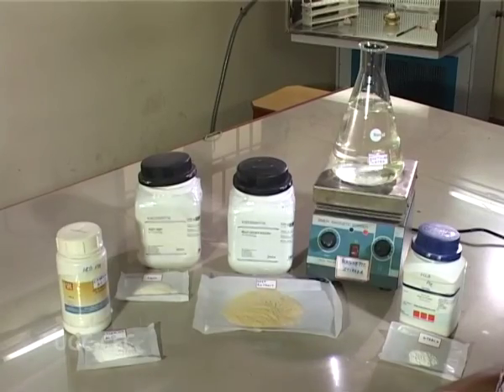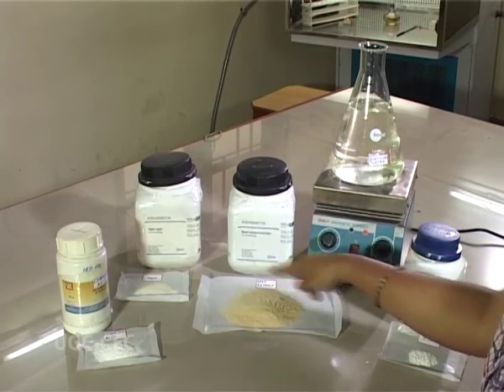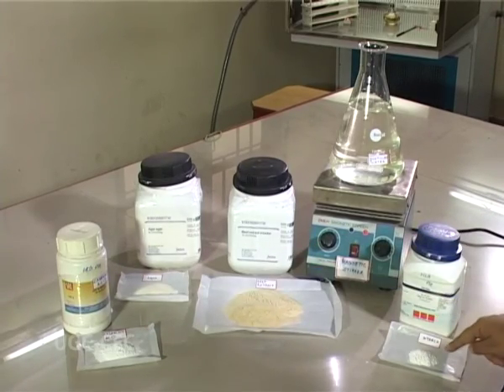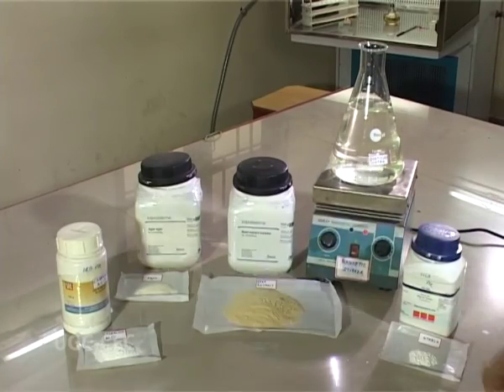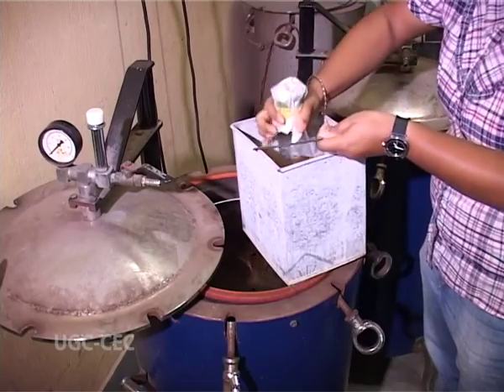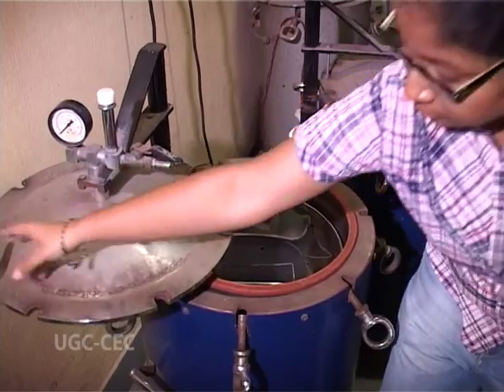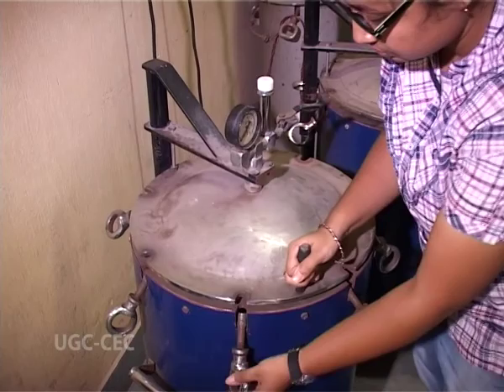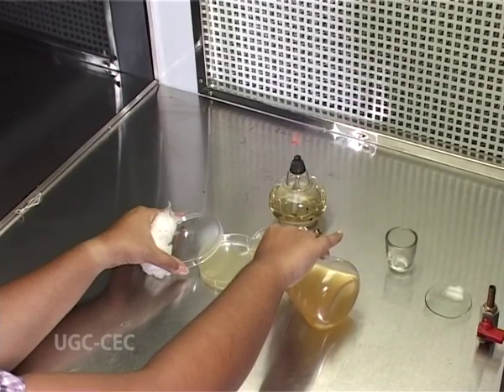The Müller-Hinton agar is prepared following the composition of beef infusion 300 gram, casamino acid 17.5 gram, starch 1.5 gram, agar 17 gram, and distilled water 1 liter. After preparing the media, they are taken in flask and autoclaved at 15 pounds PSI pressure, that is at 121.6 degrees centigrade. They are dispensed in sterile Petri plate and solidified.